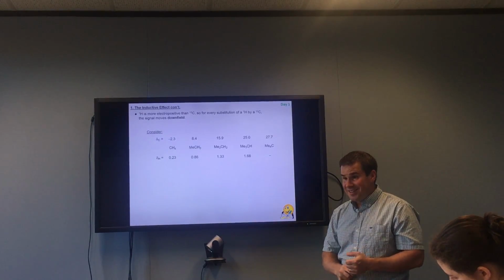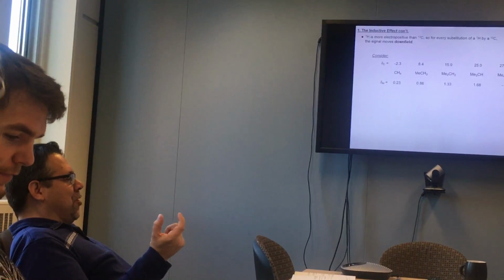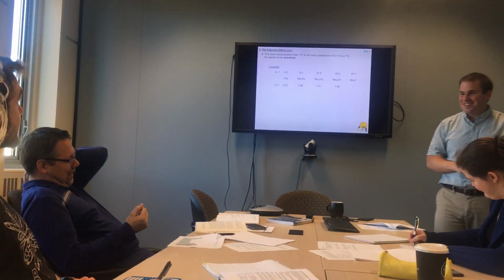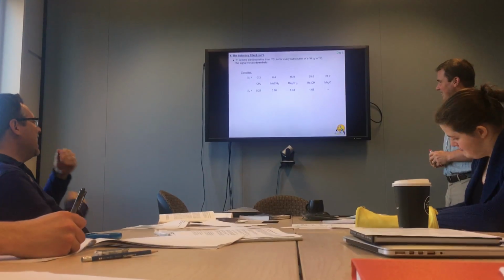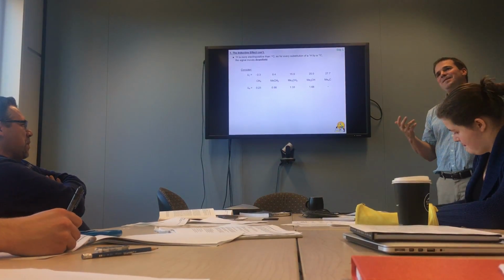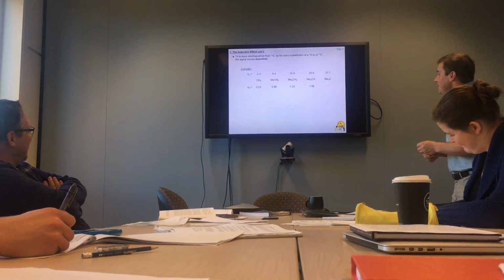Yeah, no, I'm just thinking. We don't want to guess. Generating gases, generating flammable gases. You can see hydrogen in the NMR as well. That's when I start shaking. I'm not saying that some things are better not to tell the person who owns the instrument, but anyway.